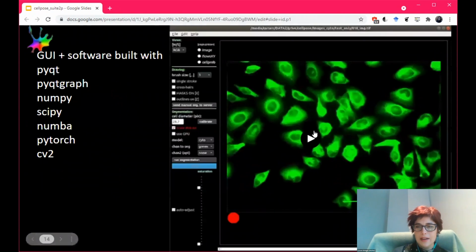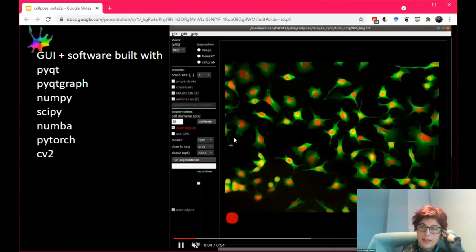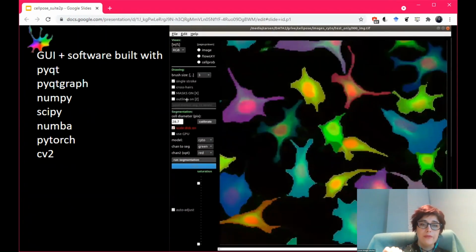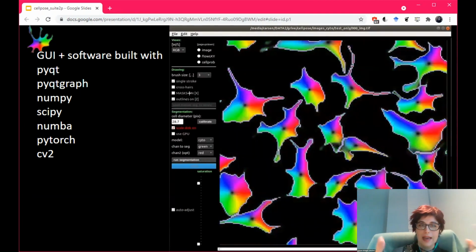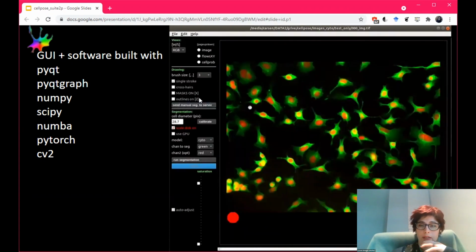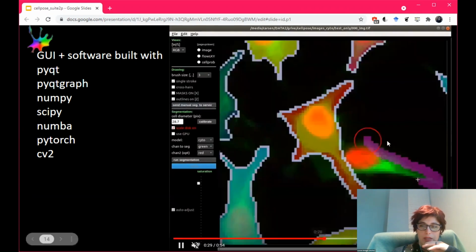All right, so the last thing I am going to show is that you can use the GUI we built for Cellpose to segment your images if you want. You can run the segmentation in the GUI. Right now, I was estimating the cell diameter. I didn't go into that, but this is a good point for users. If you know your cell diameter, you should definitely put it into the algorithm, because it can try to estimate it, but it won't be perfect. If you know your cell diameter, it's good to tell the algorithm, because that will help it do better.